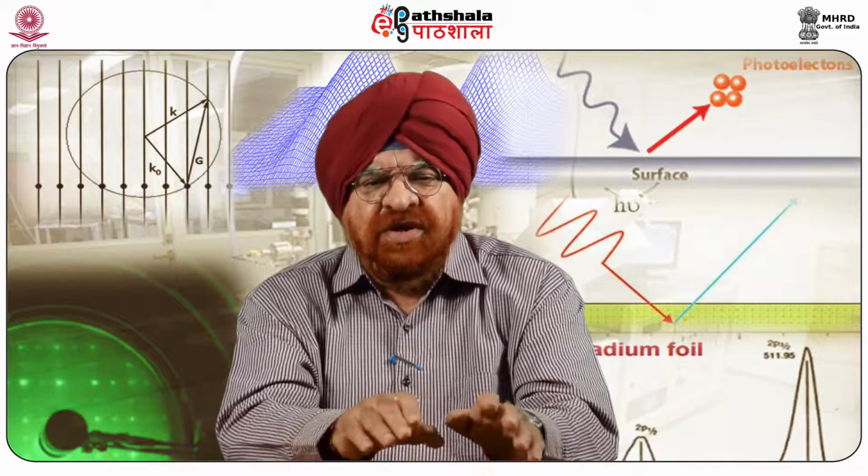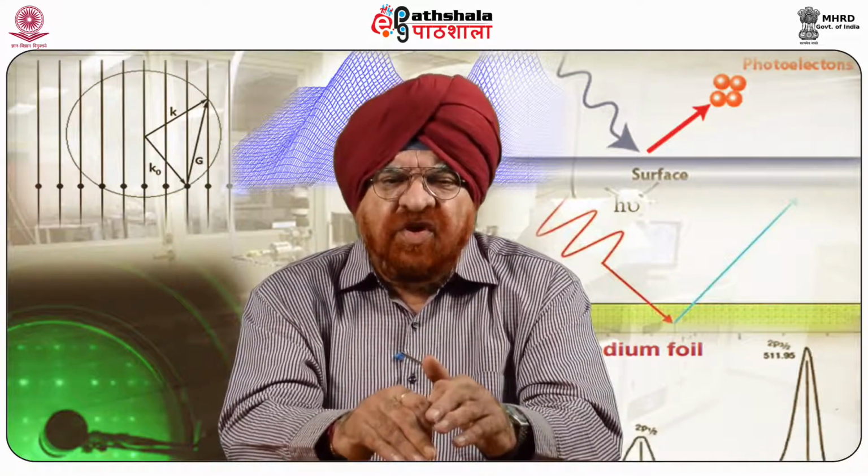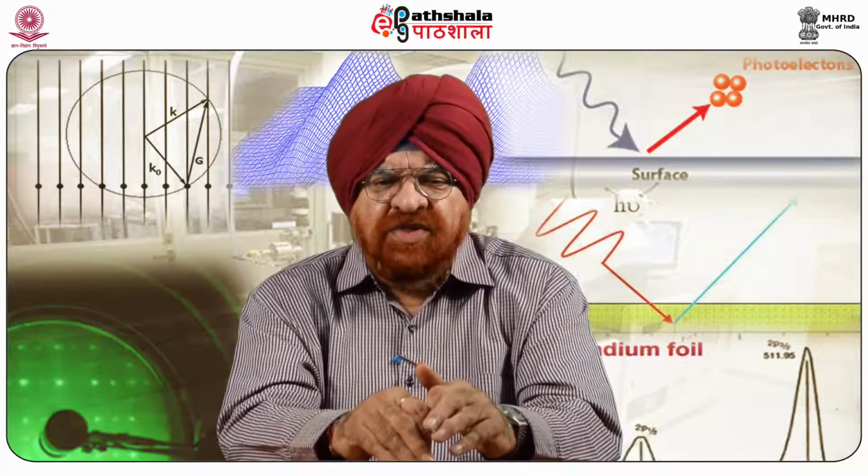The biggest part here is that even the softest sample can be imaged without damaging it.